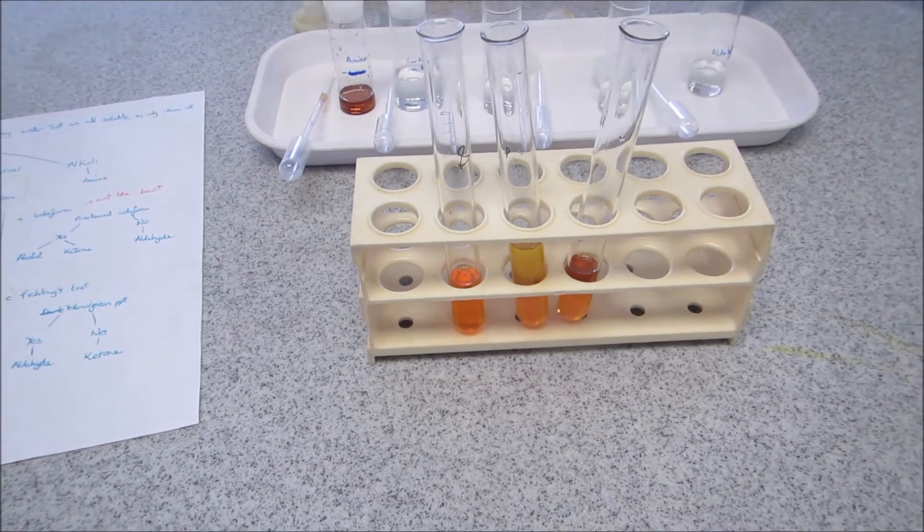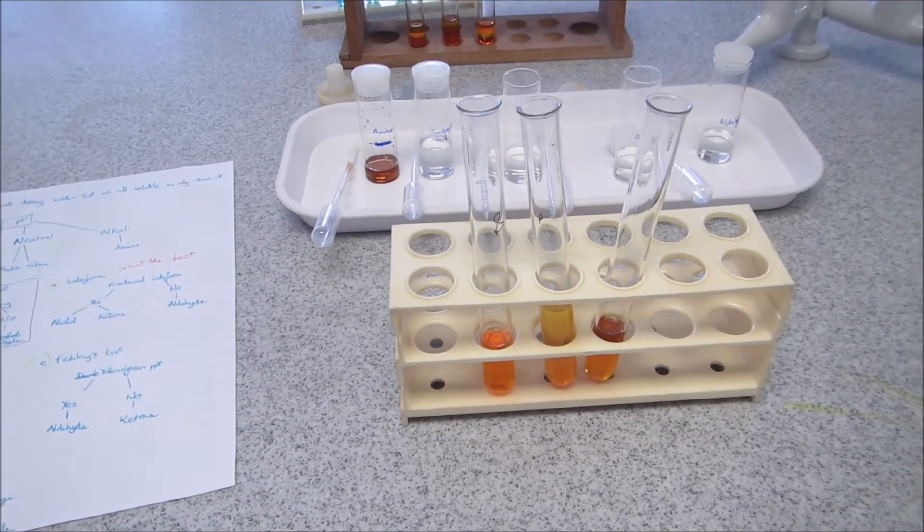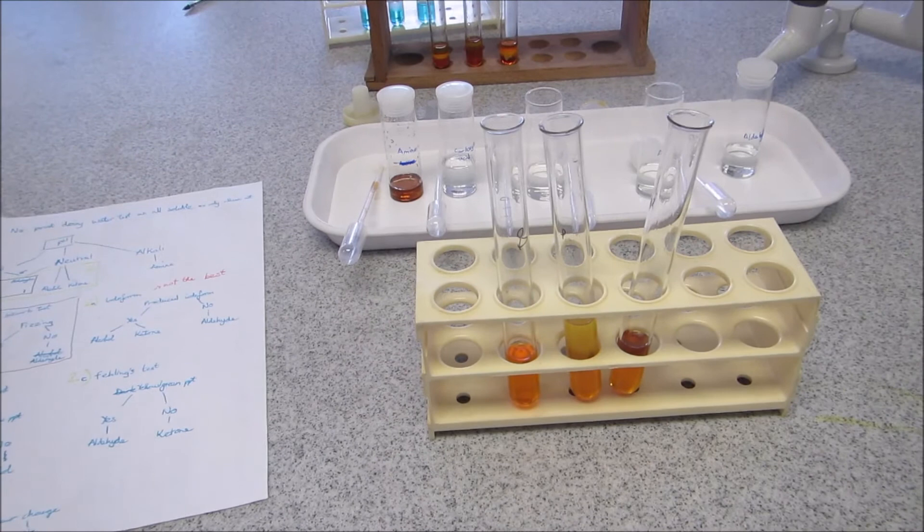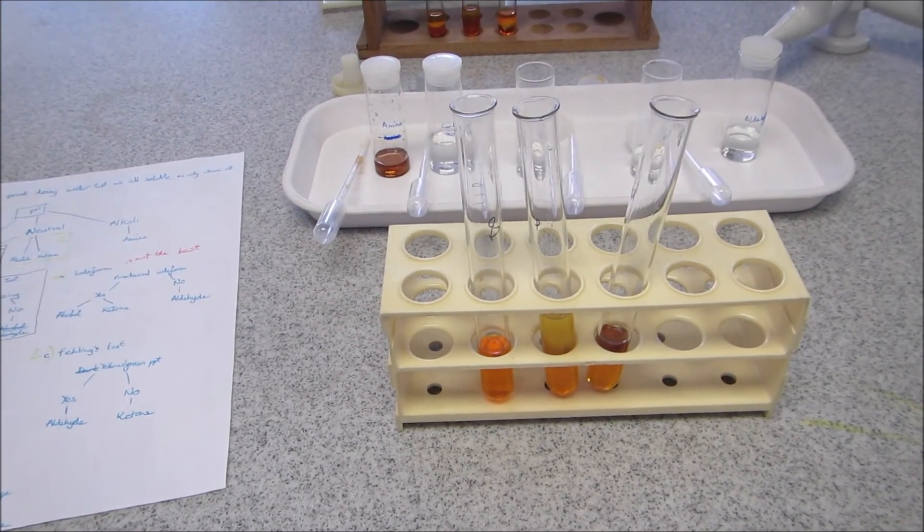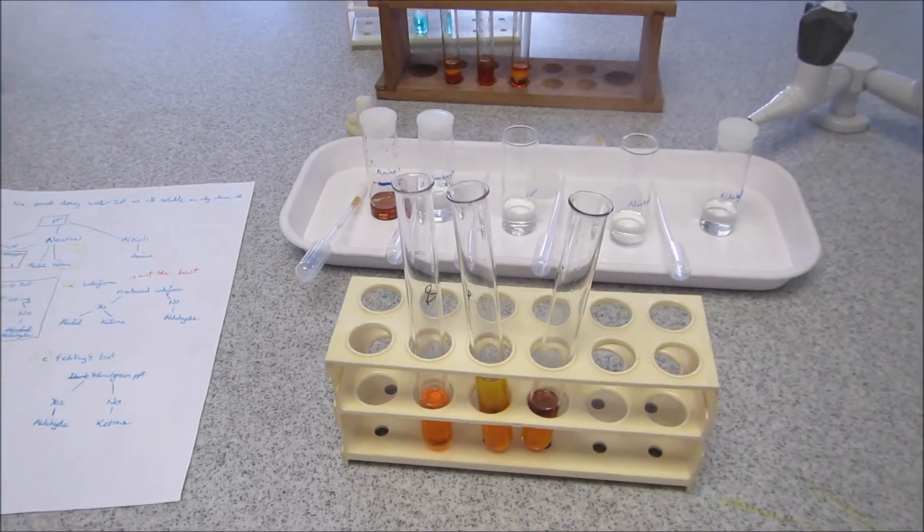So that's just showing you a few of the reactions. And based on this, you should be able to identify your amine, carboxylic acid, ketone, alcohol and aldehyde in a solution.